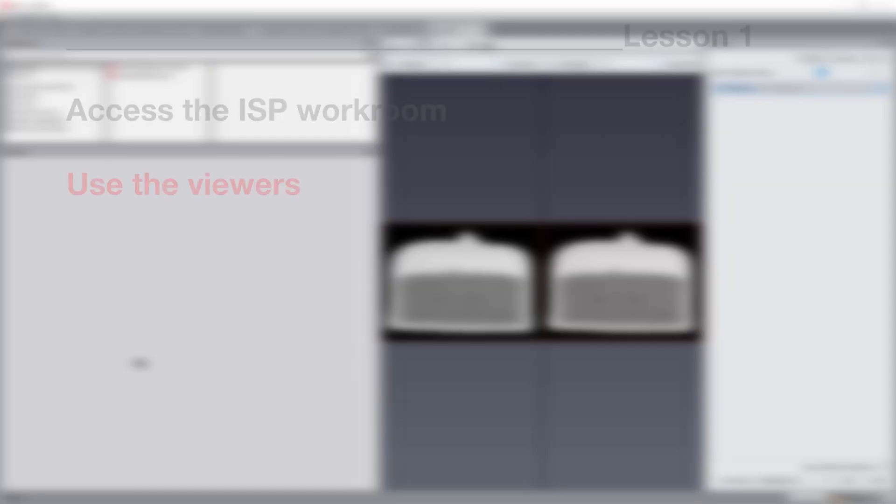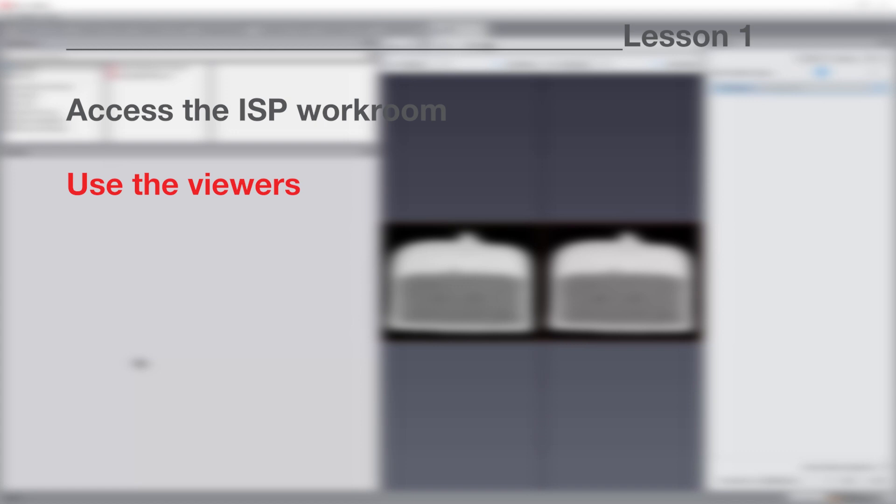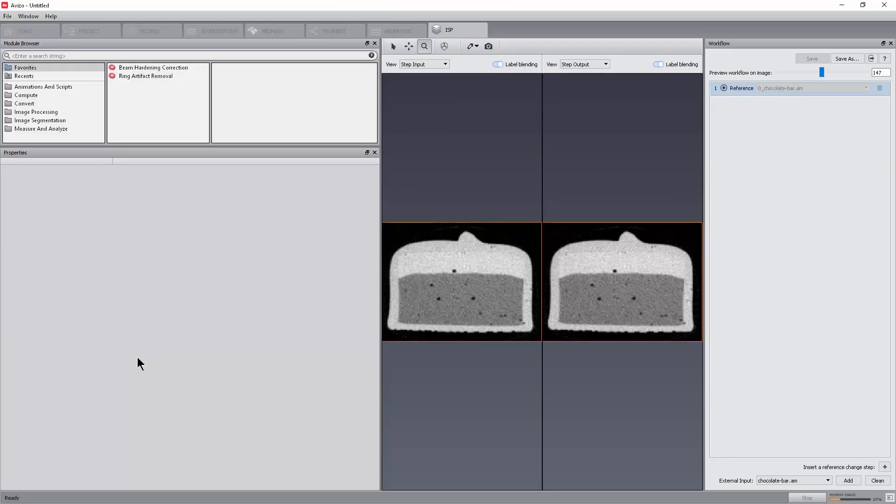We will now see how to manipulate the viewers available in the Image Stack Processing Workroom. The Image Stack Processing Workroom is set up with two viewers in a horizontal layout. By default, the left viewer displays the selected Step Input and the right viewer displays the selected Step Output. The cameras of the two viewers are always synchronized.